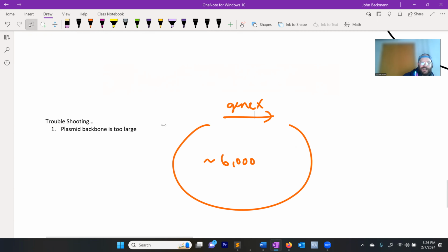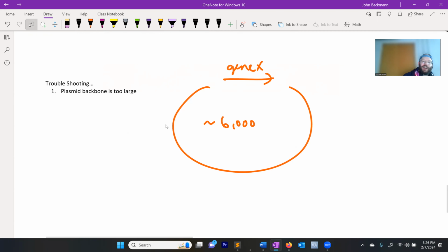So let's ask, how would you solve this conundrum of you really need to mutate gene X, but gene X is in some yeast plasmid, let's say pS2, and you can't get your quick change reaction to work? What should you do? Okay, so there's one word that conveys all the information that you just said. What's the one word? It starts with a type of cloning. Subcloning. That's the word for what you said.